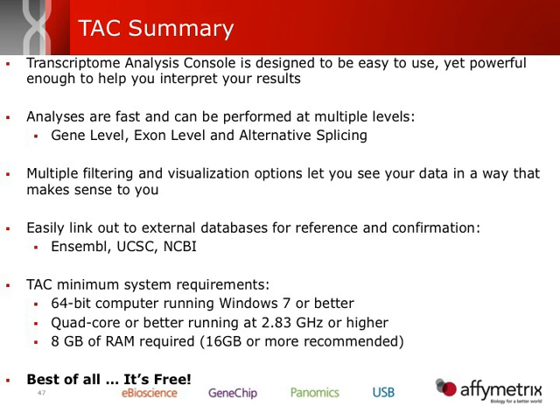Very quick, very easy. Now, there are some minimum requirements to run Transcriptome Analysis Console, the biggest of which is that you need a 64-bit computer. Most computers these days are 64-bit. If you don't have one, you can try to collaborate with somebody that may have one. Check with your core facilities and things like that. A lot of times they'll have a computer as well that you can have access to.